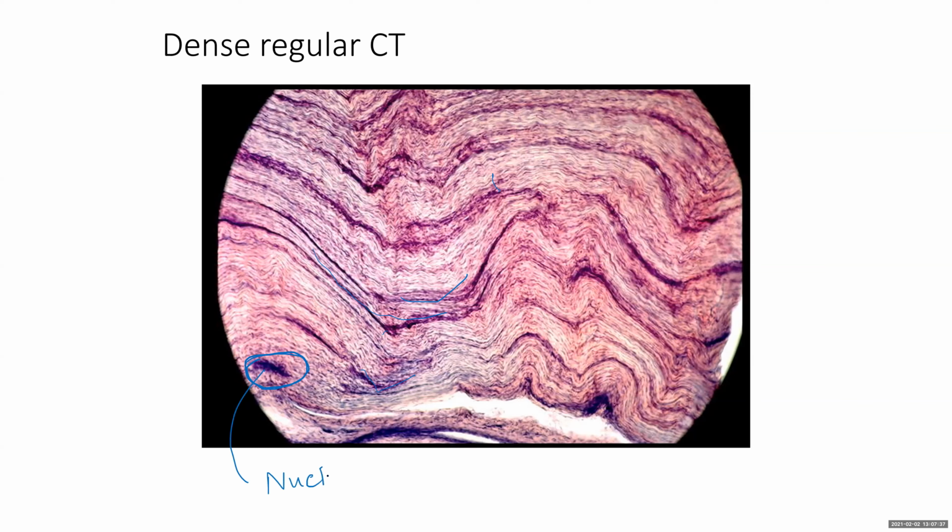You can see the nucleus of fibroblast. This is probably another nucleus of fibroblast. And this one, this is another. So only in places you can see the fibroblasts.